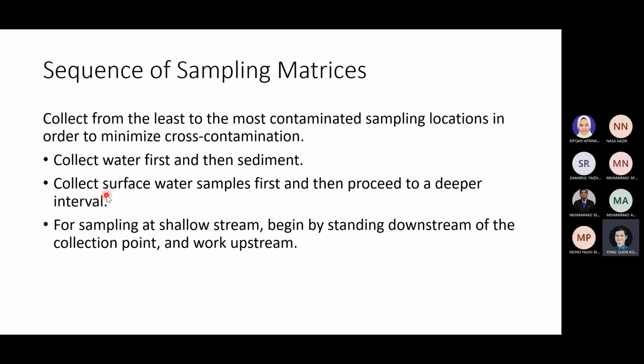Deeper strata of a river usually will contain heavier components that include sediment. So when a river flows, the current will carry a little bit of sediment, but it may not float as high. It may just hover around the riverbed. So when you collect deeper water, you are perhaps going to get more sediment, less oxygen. And if you pull it up, it will bring a little bit of sediment. So again, cross contamination, even within different strata inside a river.